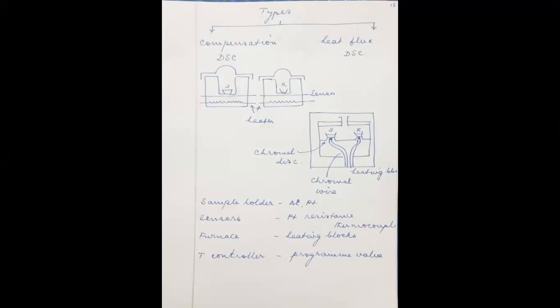See, the main business is here. You are not simply measuring the temperature difference, you are very much concerned about the quantity of the heat energy supplied in Joule. So, what is the heat energy supplied? Calorimetry. So, the temperature controller is a very important part of this system, and also the computer programming system plays an important role in controlling the temperature and in controlling the rate of heating of the substance.